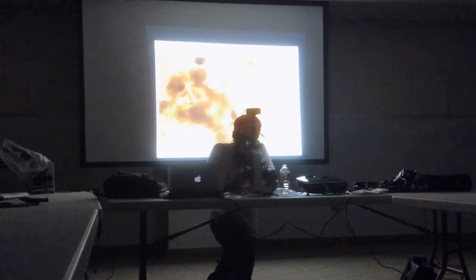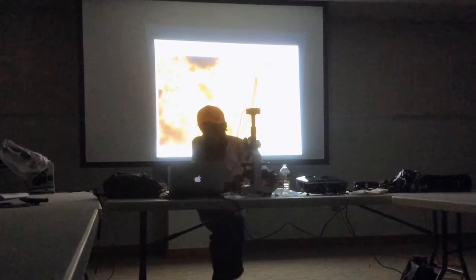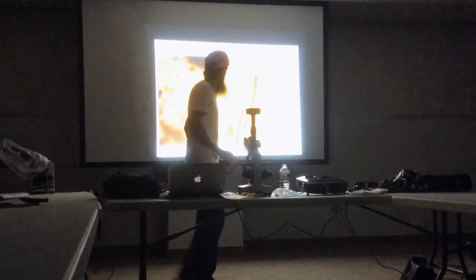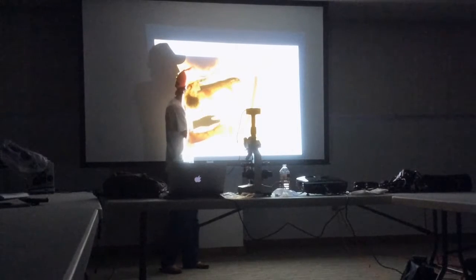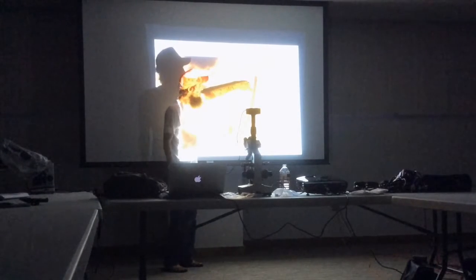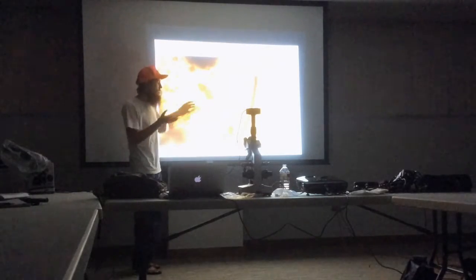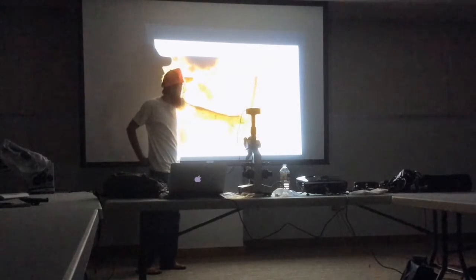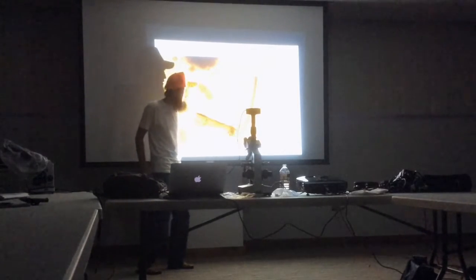But check this out in terms of fungus on my slide. I got some good stuff going here. And another thing, you see how this guy has segments in him? This is different than the yeast that were stuck together. This is actually one fungus with these segments. The segments put them in a special family of fungus, but these tend to be also beneficial when they're segmented like that.